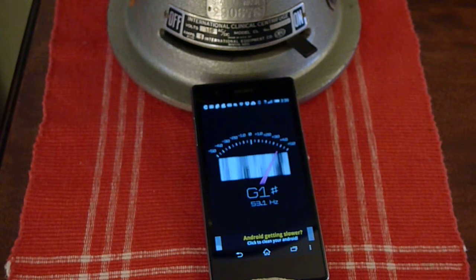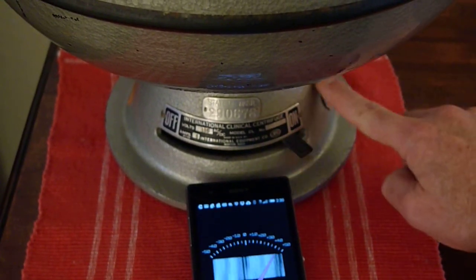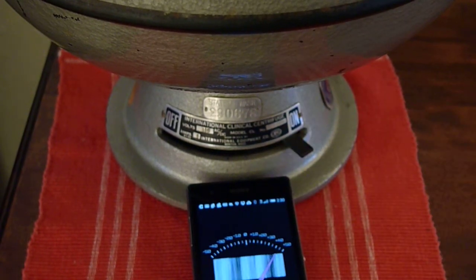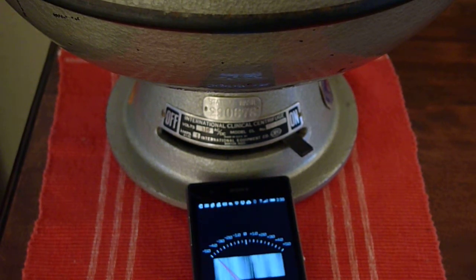This is an old version of the International Clinical Centrifuge — an IEC clinical. The old version has sleeve bearings and you need to oil it. Under there is a little thing you unscrew; it has an oil wick in there, and what you do is put oil on the oil wick. There's another one inside. To find out more about how to oil an old motor, look at the guys who are refurbishing antique fans — you'll find out what kind of oil to use.